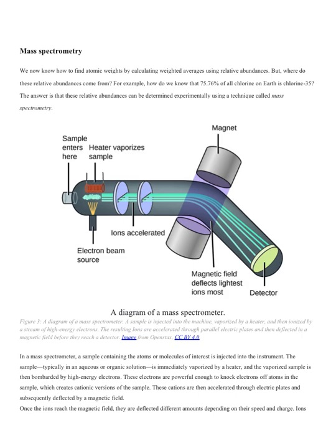But for the sake of AP Chemistry, what you'll do is you'll put your sample in here. So let's say in this case, I think they're doing one which is on zirconium. So you put in a sample of zirconium element, something you mine from the ground, let's say. You run it through this machine, and the key thing is you'll notice that as isotopes pass through and enter the magnet, they will be deflected by the magnet.